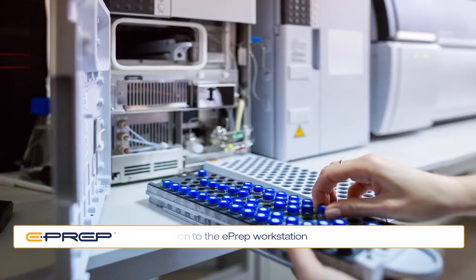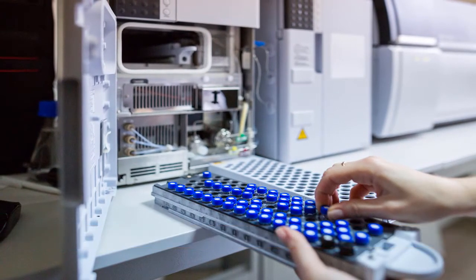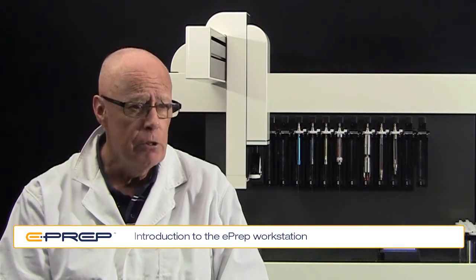Hi, I'm Jared Sharp, and I'm here to introduce you to the ePrep Workstation. The purpose of this short demonstration is to show you the ePrep Workstation and its capabilities, and how easy it is to create a workflow, and then we'll see the ePrep in operation. I'm going to show you how to set up for the preparation of a single standard, and then I'll extend this to a range of working standards.